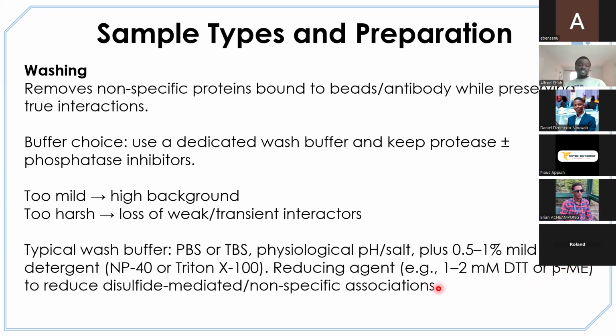They disrupt these disulfide bonds between the other proteins, because our interest is to get only protein A and then B and or X and nothing else. So if you see them in any protocol, DTT or BME, they just disrupt the disulfide bond between proteins.